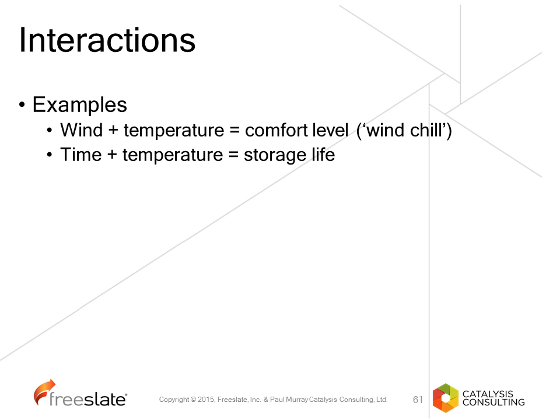So experimental design will tell us what factors are important and what the important ranges are. The other thing that experimental design will tell you about is interactions. Interactions are very simple: where you have two things, you change them together, and you get more of an effect than you do by changing either. So if we consider wind and temperature, you can have a temperature outside, and depending on the wind and its direction, you will have what it feels like. So the actual temperature that it feels rather than the temperature it is, or potentially the wind chill factor.